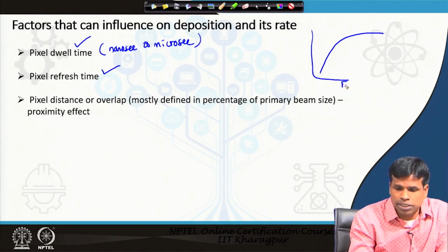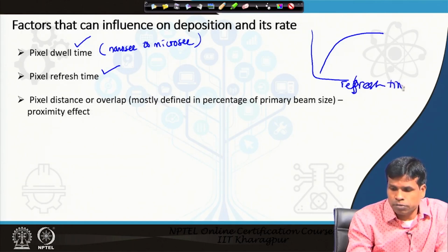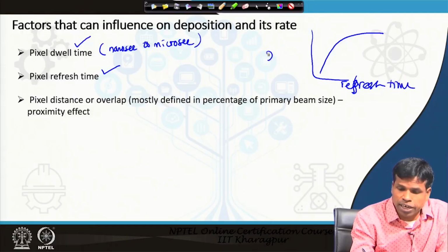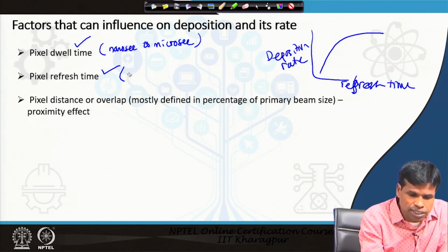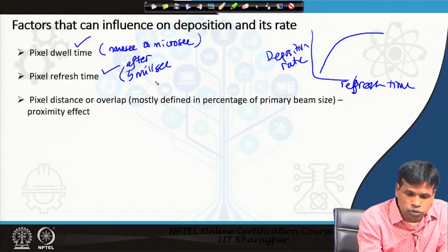Looking at refresh time versus deposition or growth rate, it will increase, then saturate, and normally it saturates at around 5 milliseconds. After 5 milliseconds, saturation occurs.